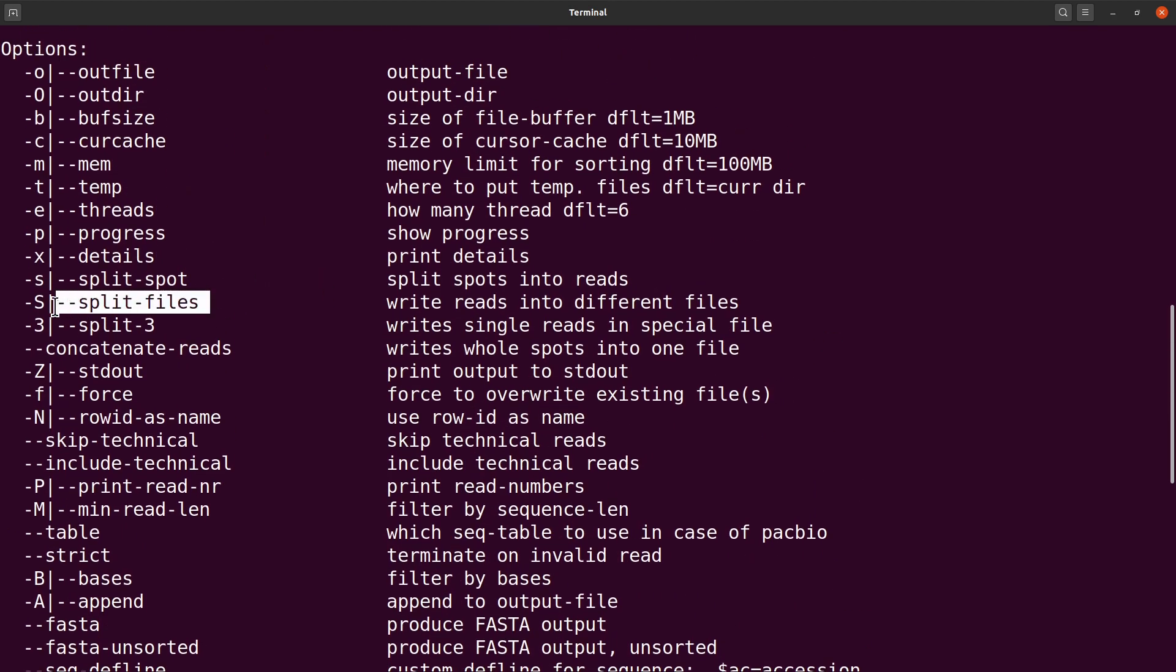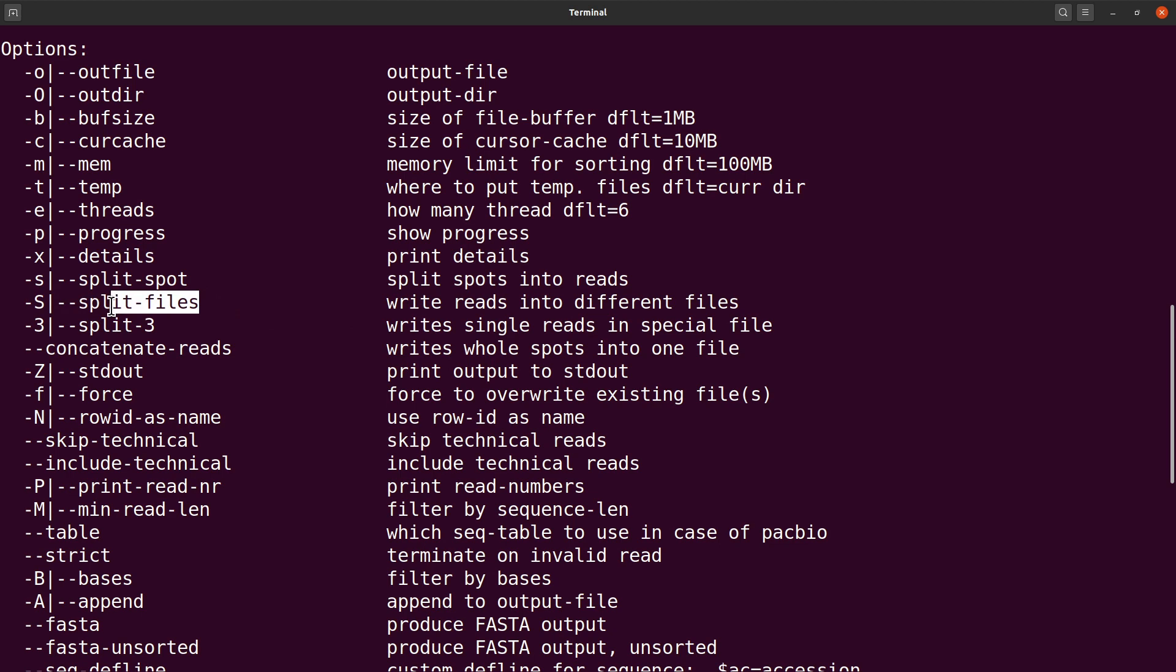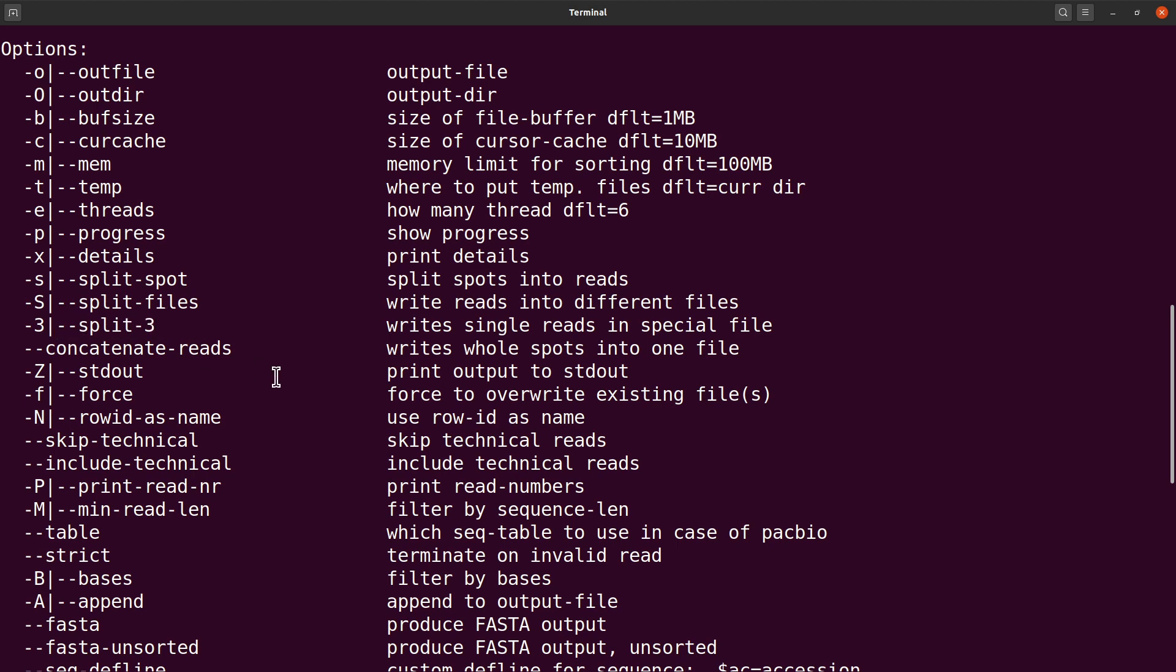The option you have to use is either this or that. The split-files here means that your reads have mate pairs. If you know your reads have mate pairs, then you use this option. If some of your reads do not have mate pairs, then use the split-3 so that those without mate pairs will be written to a different file.